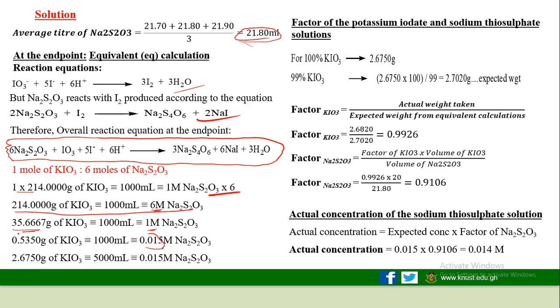That has been done here. And then you multiply this side too by 0.015. Whatever you do to this side, it affects the mass side, right? Good. Then the next step, we step up the volume to 5 liters, by multiplying this side by 5 and multiplying the mass here by 5.